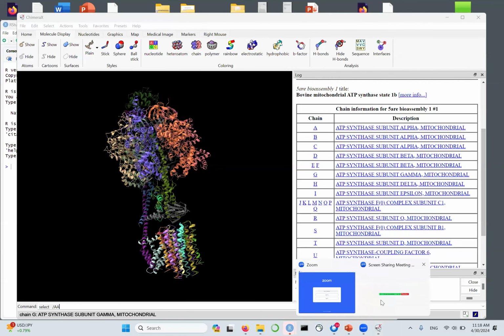This is what the CATH database is using to classify protein structures. And they also provide services where you can submit your structure, and then CATH is going to try to find out which fold your protein belongs to. So that's helpful if you have a new protein and want to learn something about it. You compare it to known proteins, and if there are similar proteins, your protein might behave in a similar way or might have similar properties.